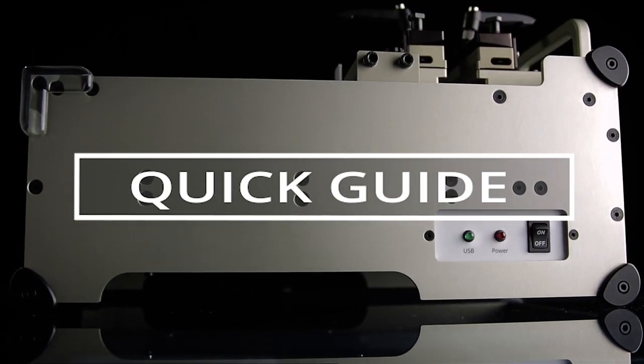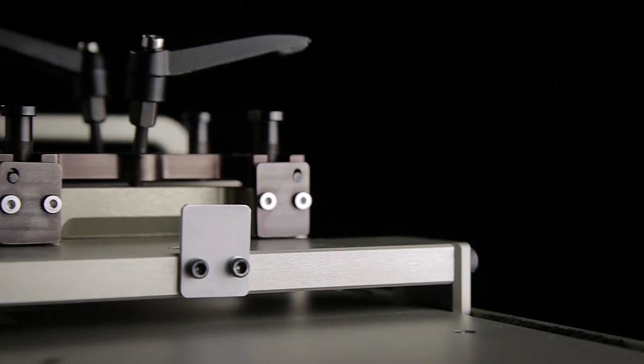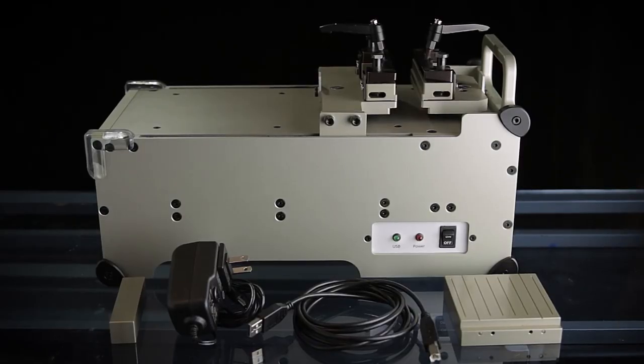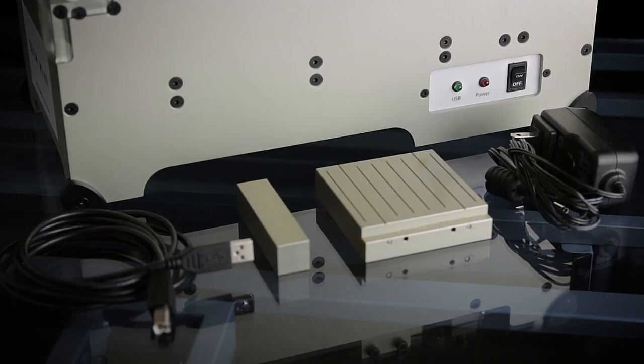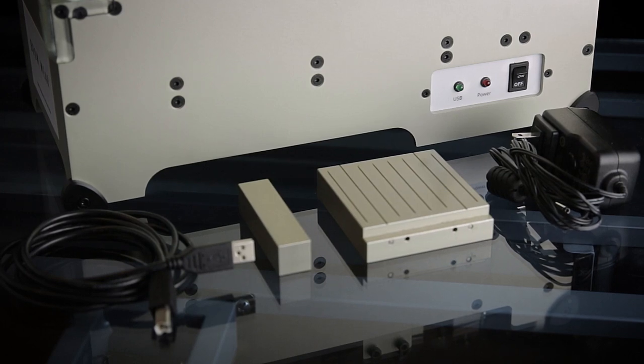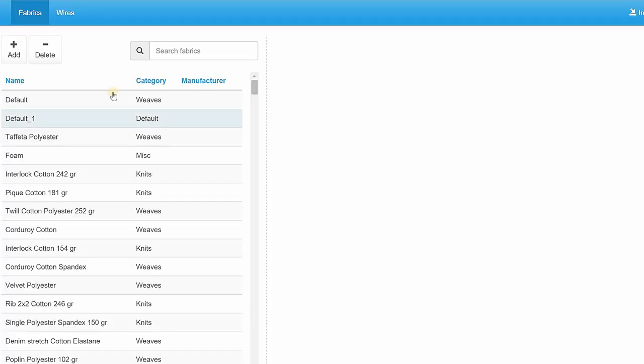Welcome to part two of our two-part quick guide video series for the Fabric Analyzer by Browseware. In part one, we provided an overview of the FAB's parts, accessories, and their function, as well as the basics of installing the DB admin software and setting up the equipment. So be sure to check out that video if you need a review. In this video, we'll walk you through the steps to test your very own fabric and add it to the database.